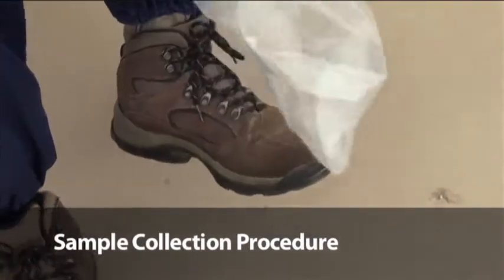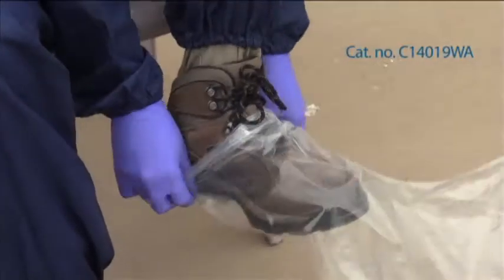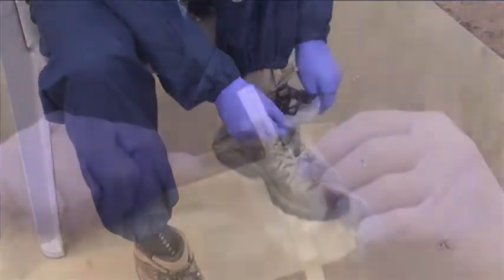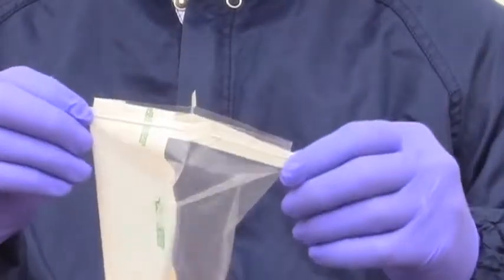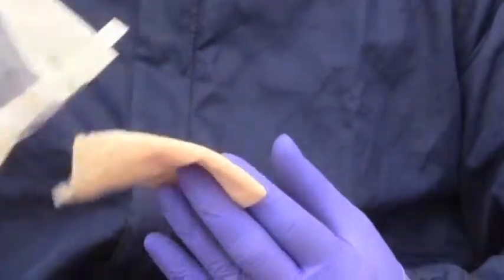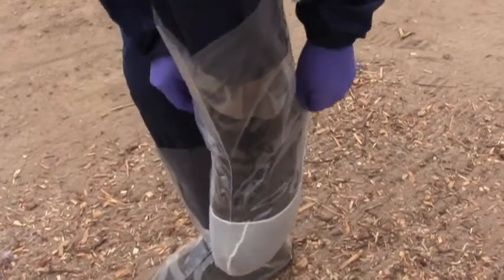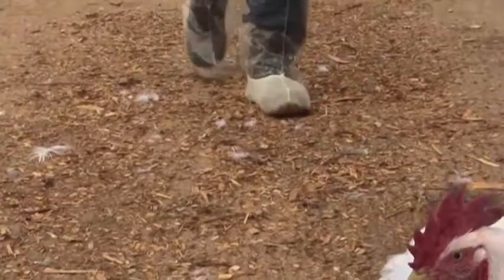Here's how it works. Slip on a disposable plastic shoe cover to protect your shoes and prevent cross contamination. Tear off the perforated end of the sterile sample bag and remove the pre-moistened Envirobooty. Place the Envirobooty over your plastic shoe cover, then walk through the sample area.